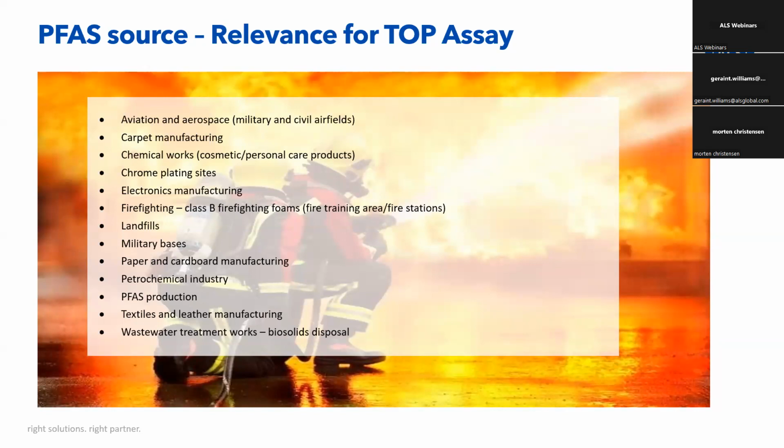But just going back to the main point, I would say TOP assay would be used wherever there's AFFF impact. So if you've got aqueous film forming foams, fire training areas, etc., where there's high concentrations of a number of different precursors, then that's basically where to use TOP assay as a technique. There are other places where you could use it, but that would be the more common approach for TOP assay.